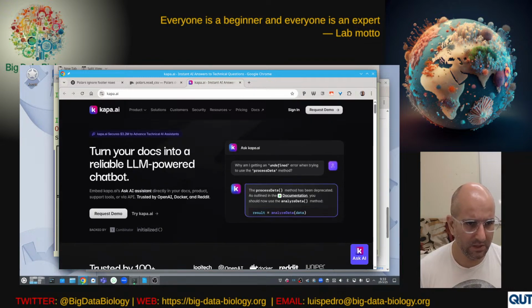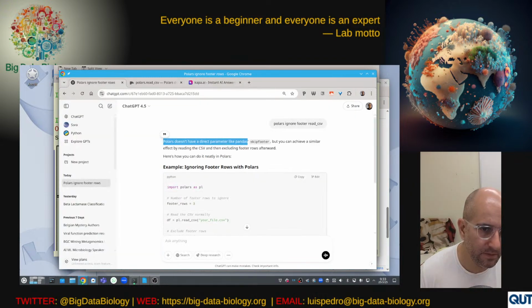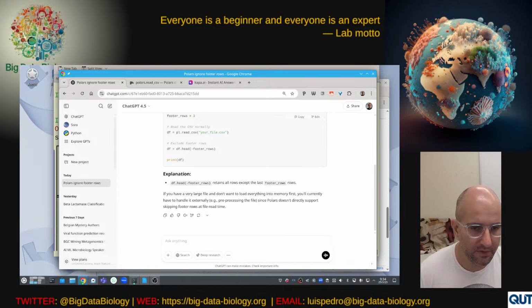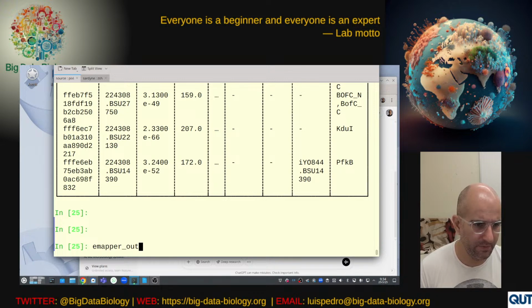I want to check this. I'll check this later. I've been wondering, for example for SemiBin, it would be nice even for us to see how the tools connect together: how you use SemiBin with NGLess, how you prepare the data, and maybe you want a mapping with Strobealign. It'd be very nice to have an LLM type thing for users, so maybe that's a different idea. All right. Anyway, back to where we were.